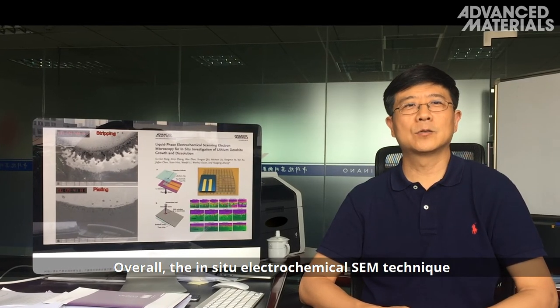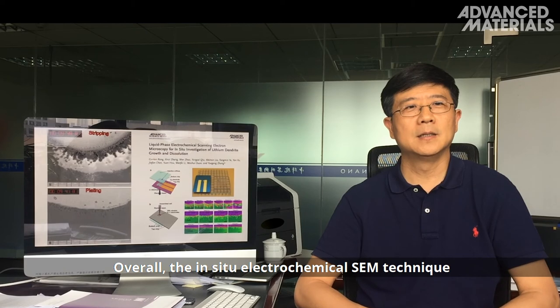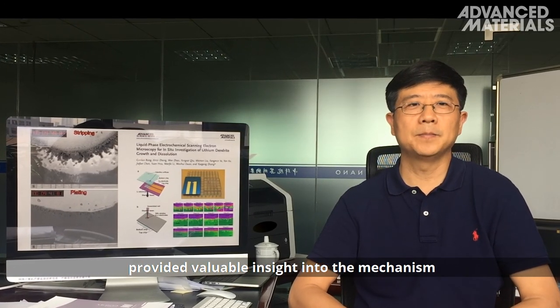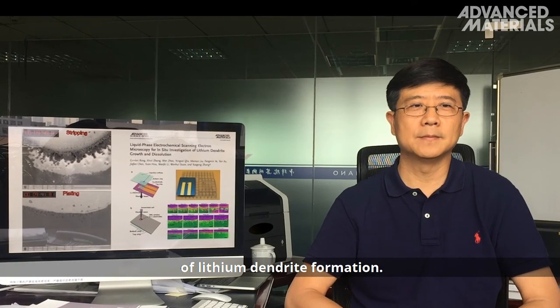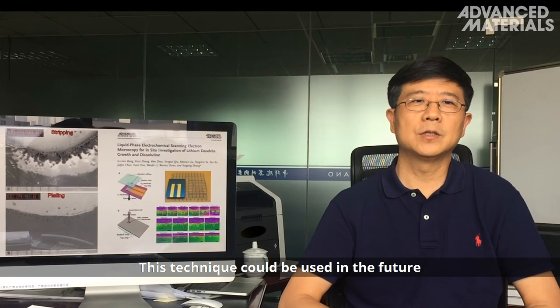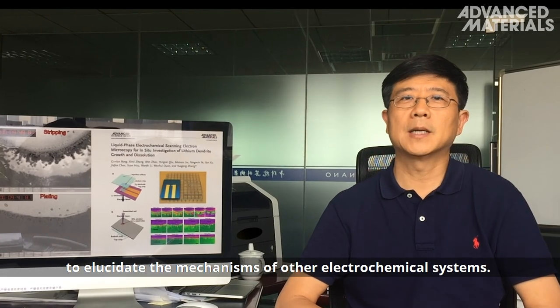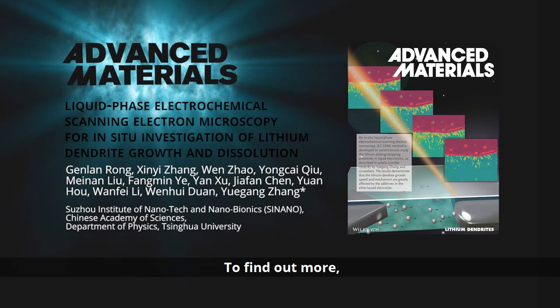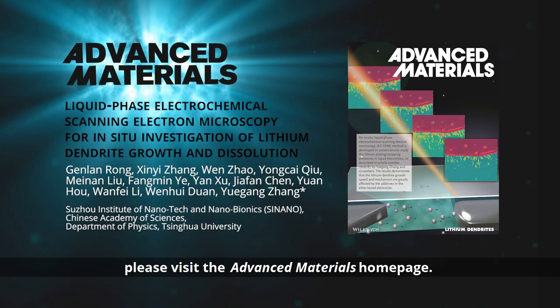Overall, the in-situ electrochemical SEM technique provided valuable insight into the mechanism of lithium dendrite formation. This technique could be used in the future to elucidate the mechanisms of other electrochemical systems. To find out more, please visit the Advanced Materials homepage.